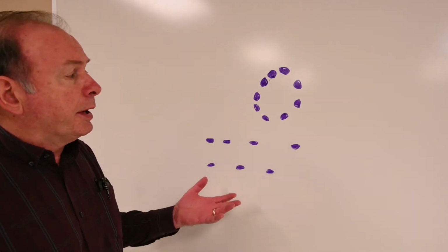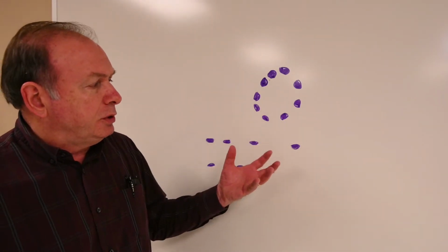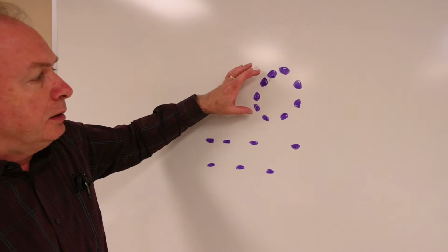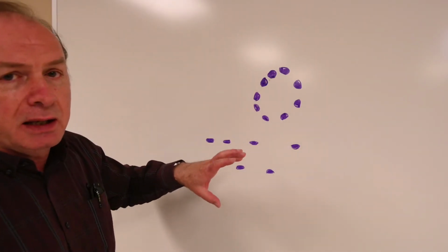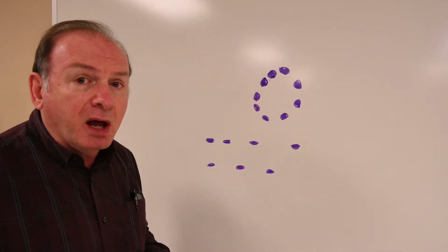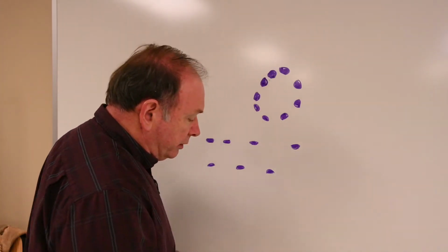I'm beginning a drawing of the red pulp of the spleen, and I put these two images, this kind of circle of nuclei and this longitudinal view of nuclei, around these spaces, these splenic sinus spaces, to kind of get us started to know what we're talking about. The cells that make up the wall of the splenic sinuses are endothelial cells, but they're not ordinary endothelial cells.